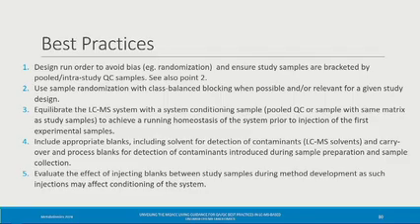And of course, we run other, let's say, spiked QCs or things like that, because our system suitability is just a mix of standards and solvent. It's not a spiked sample or a spiked QC. So that's what I want to hear from you. Is there any recommendation? Should we change something related to that?